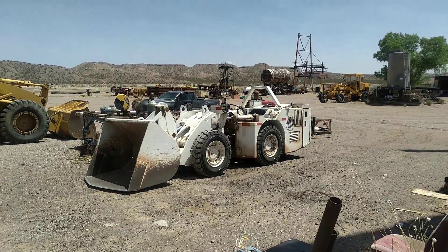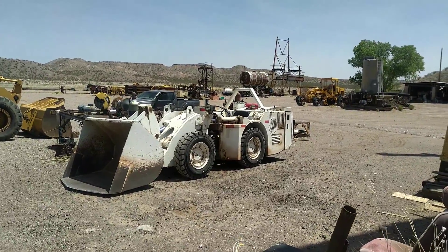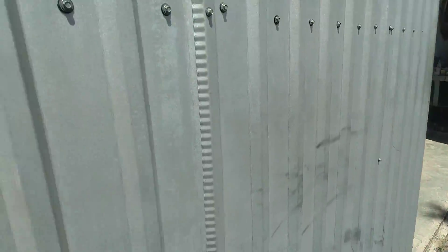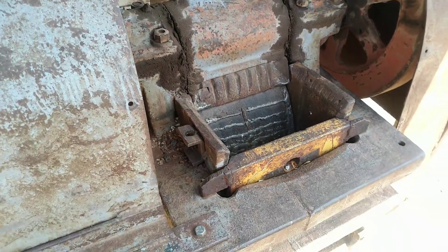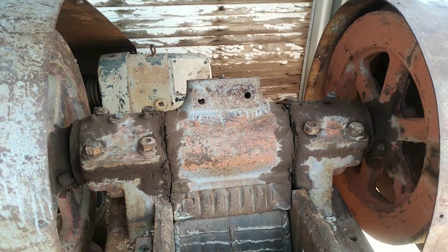We just used the 911 to remove some waste material from the assay lab and trash from the shop. We're going to come over here to our little jaw crusher — it's like a six by ten unit, real small — but we use this for initial sample prep.